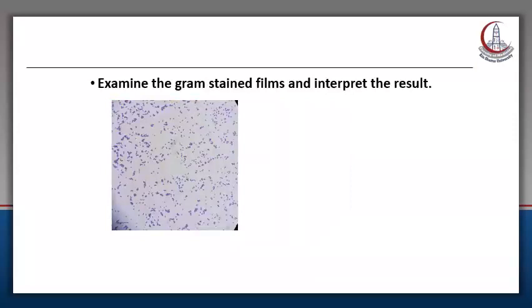As we proceed in the laboratory diagnosis for this patient, don't forget the schema for any laboratory diagnosis. The first step was specimen collection, the second step is direct gram smear, and then inoculate the specimen on suitable culture media. So when inoculating the specimen on different culture media, the colonies on each culture media will be identified by colonial morphology, then by indirect gram smear, then by biochemical reaction. So, indirect gram smear for the colonies from different organisms.